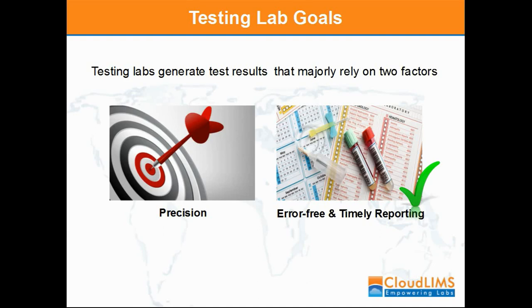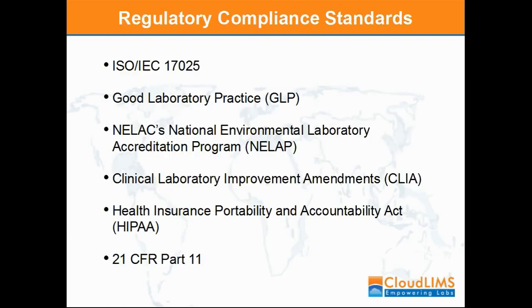The precision in turn expresses reproducibility of the results. With such complex workflows in place, each testing lab needs to follow certain standard guidelines and compliance to ensure data quality and reliability. The general guidelines are framed by regulatory bodies who assess the quality requirements. So the important question when it comes to testing labs is, what exactly are the guiding principles for quality assured testing?